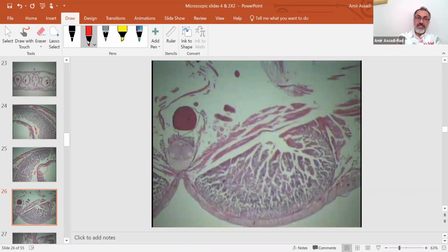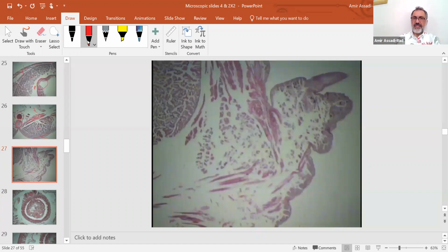Okay, now this is a blood vessel, same animal, Nereis virens, class Polychaeta. Then this is a nerve cord, circular muscle, longitudinal muscle, epidermis, and these are oblique muscles or lateral, I think it's called oblique muscles in your textbook, your lab manual. And of course, all of these are coelom. Nereis virens again, this is parapodia, all of it.